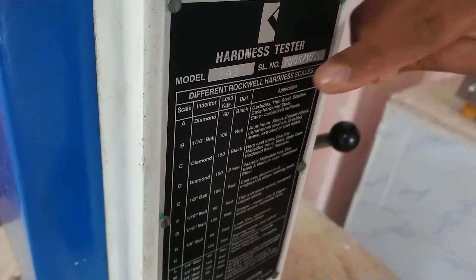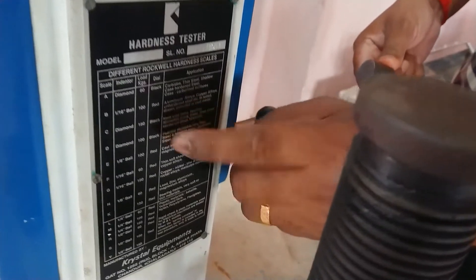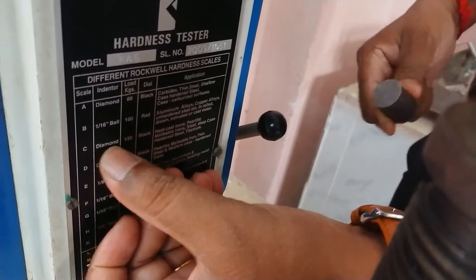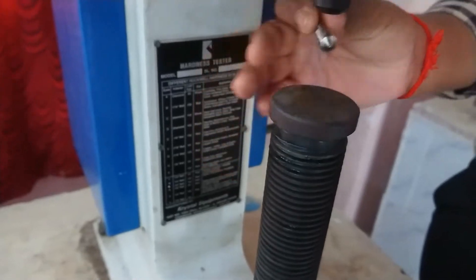What load do you have to use? These are the various materials. Here we are using a mild steel material. Mild steel comes under steel, so we use a diamond indenter. This is the cone-type diamond indenter.